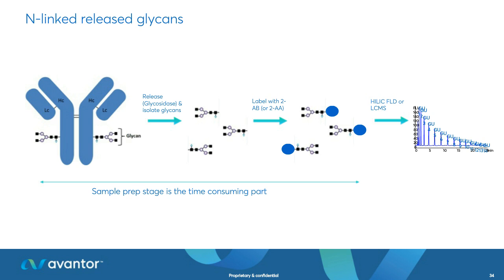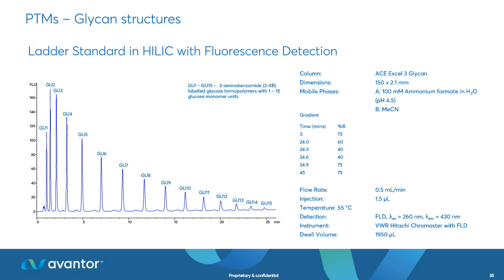When you've done that, you can get a nice pattern of what those glycans look like. You can check whether they're the right ones, whether that branched glycan is what you plan to have on your monoclonal antibody. And they're really important because they actually signal to the cell about how that antibody can get into the cell. They're important for cell clearance. They can cause a problem if there's the wrong type of sugars on there as well.